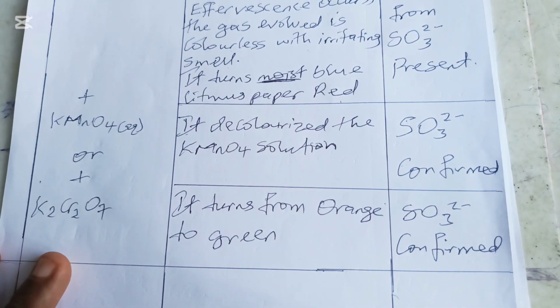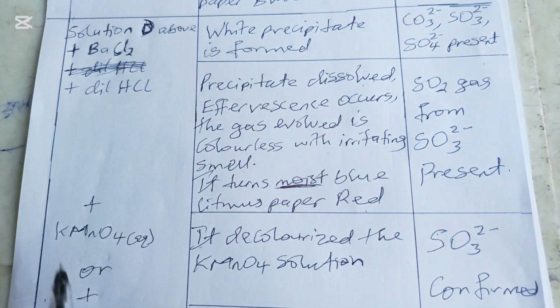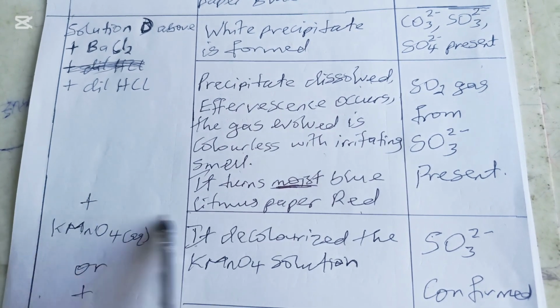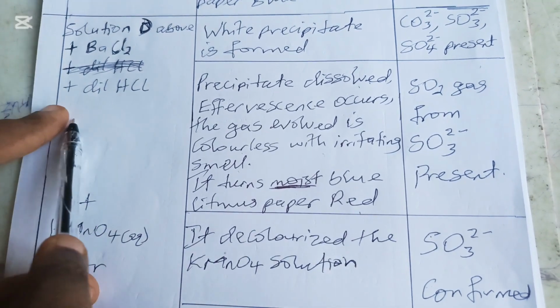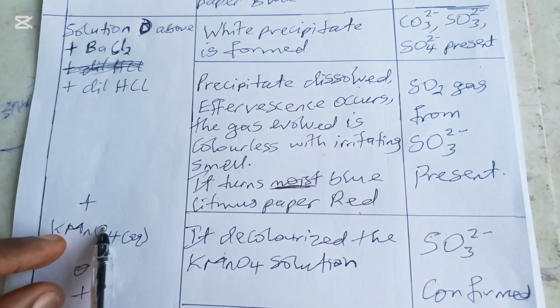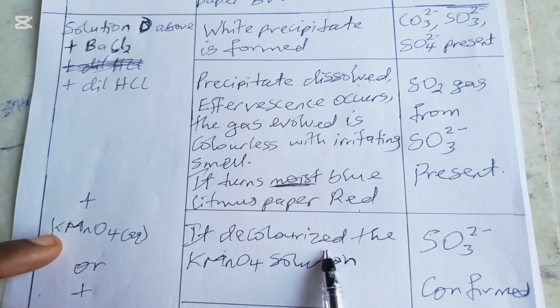Now, there are some things I said I will tell you, and they are very simple, but you have to be careful. These are the rules and regulations. Number one, look at what I did here. I said plus dilute HCl. If I write plus KMnO4 here, I left a gap. Most students will write plus KMnO4 here, but they will not write decolorizes here. Nobody will mark here, because we believe the observation will start directly from the line. That's one of the warnings you have to be careful of.